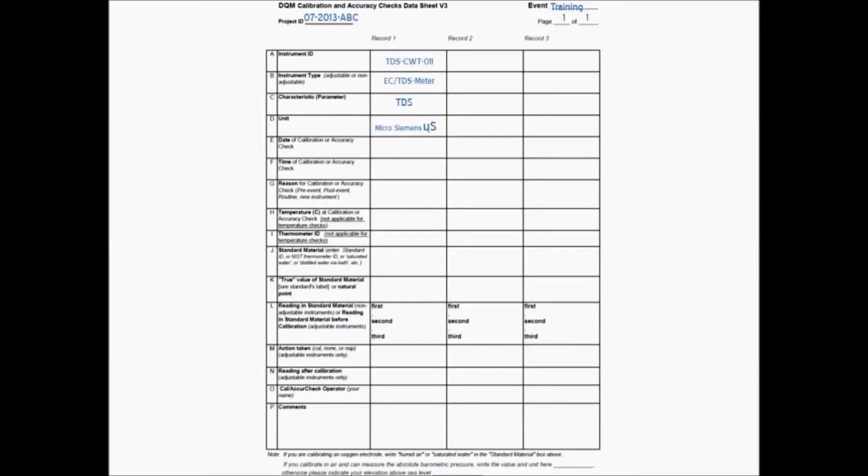Time of the calibration event was 1 in the afternoon, or 1300 hours.